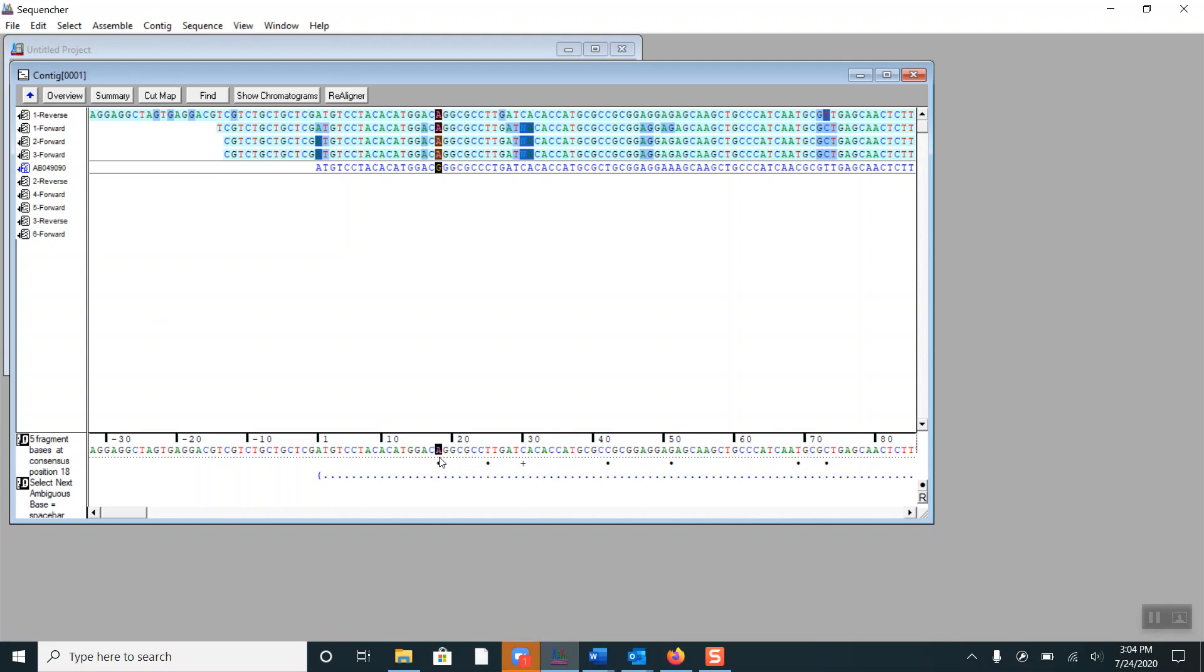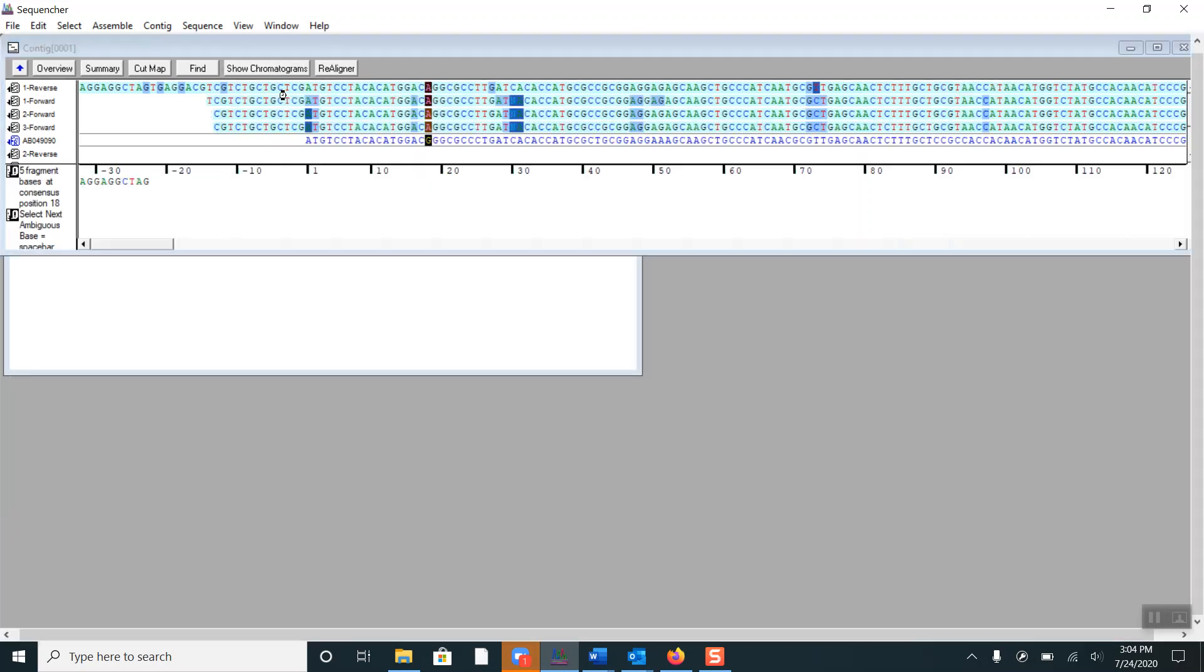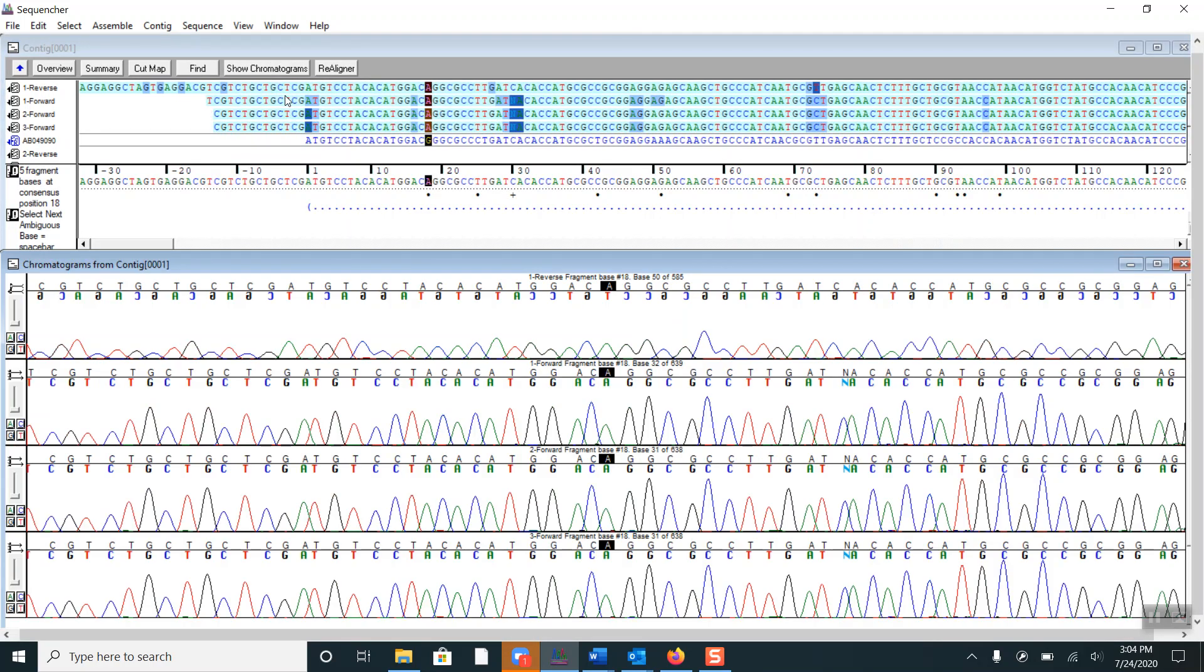Here the reference sequence has a G, while the four fragments have A's. If I click on Show Chromatograms, we can see that each of the fragments are clearly an A, so we don't have to do any editing at this location.